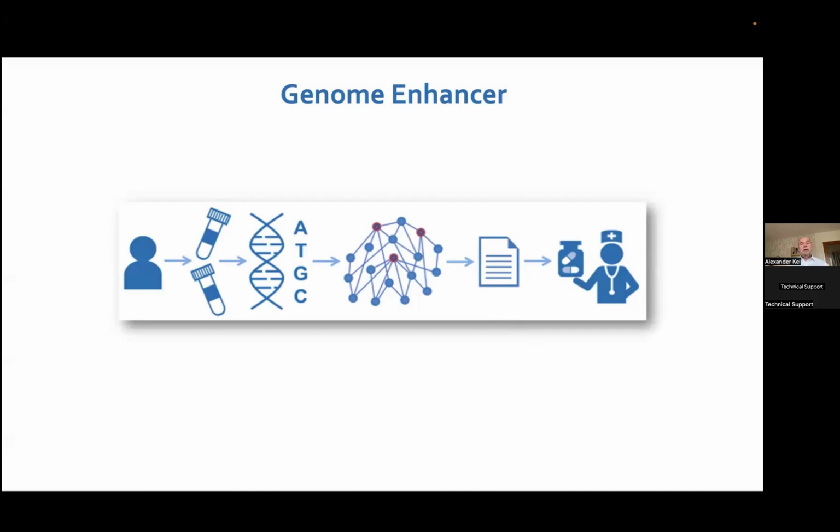It goes further to see how these changes in transcription factor binding sites may lead to the change of the regulatory circuits in those cells in general. And then it goes into the algorithms which analyze those networks and identify so-called master regulators. So the sensitive points in those networks, which can regulate big cascades, I would say.